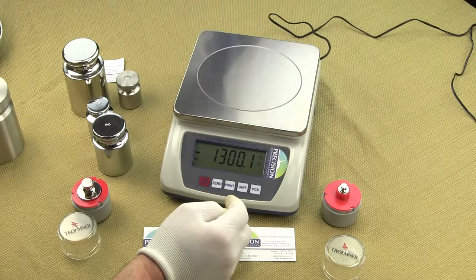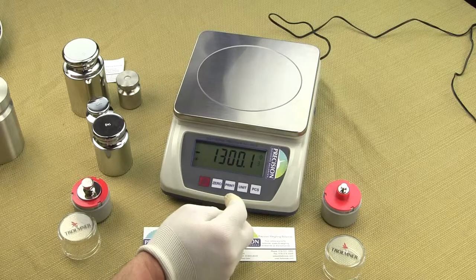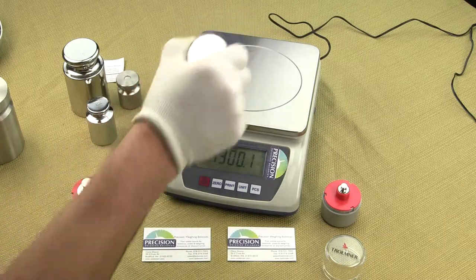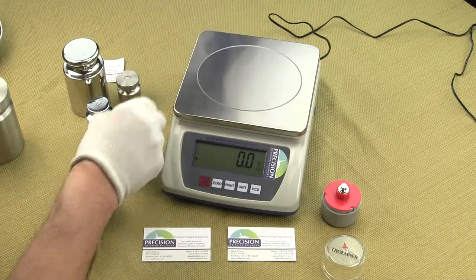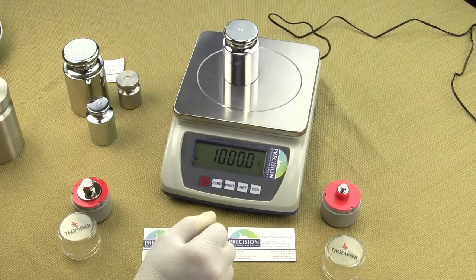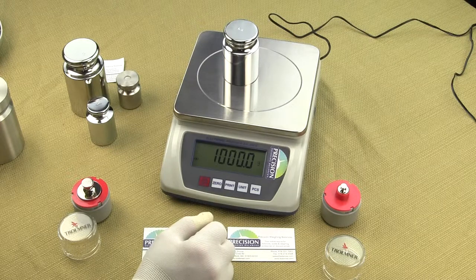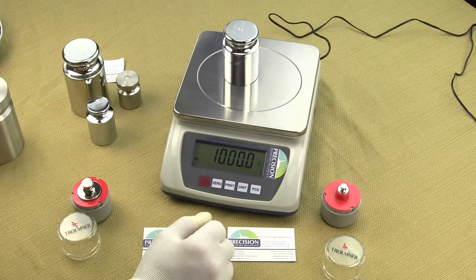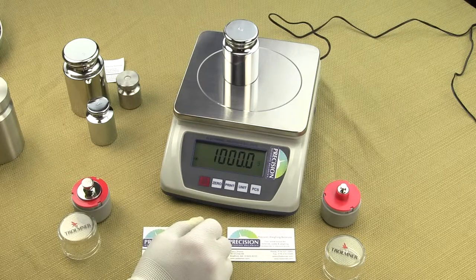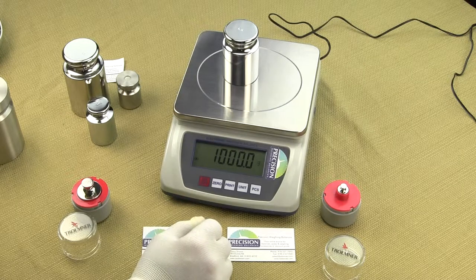The EPB is one of the few scales on the market that allows you to use any size calibration weight within the weighing range of the scale. We always recommend calibrating with at least 50% of the weighing capacity: a five kilogram weight for the EPB10K, three kilogram for the EPB6K, and 1,500 grams for the EPB3K. But if all you have is a one kilogram mass, you could calibrate all three models with it. We'll be making a video on how to calibrate your EPB Precision Balance.